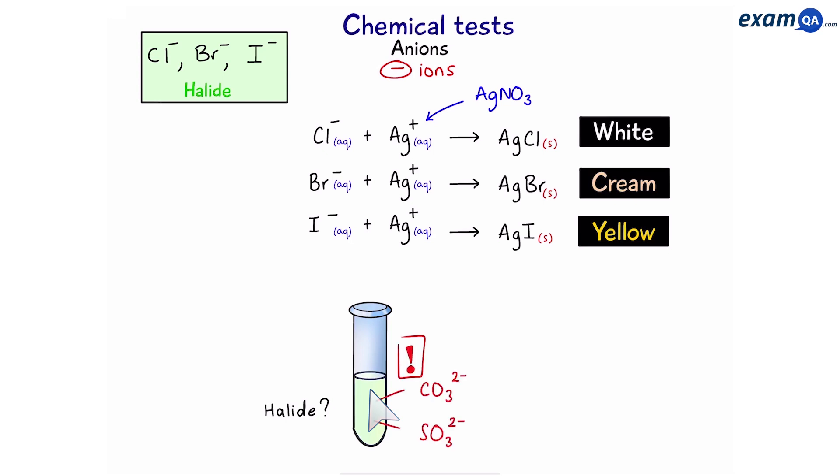Now again before we add our silver nitrate we have to make sure there are no impurities. This time we're going to use dilute nitric acid not hydrochloric.